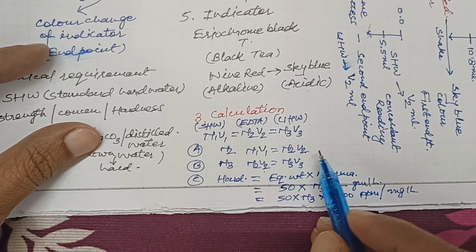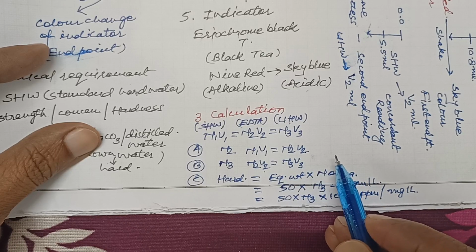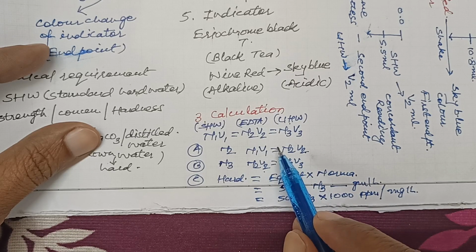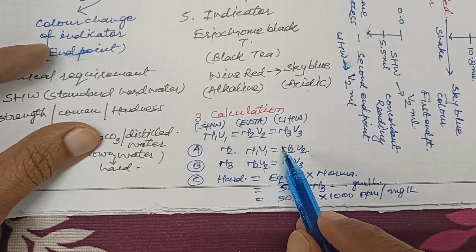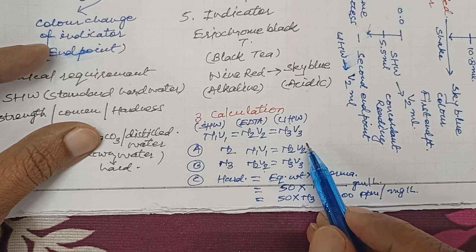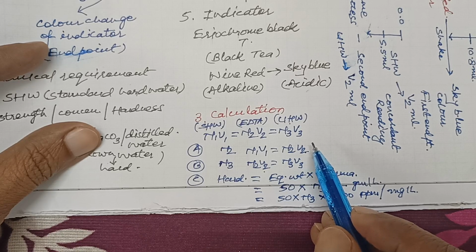This is the particular titration, and the observation table for this particular practical is very simple. So I am not discussing the observation table here. And this is all about the determination of hardness of water in the laboratory.